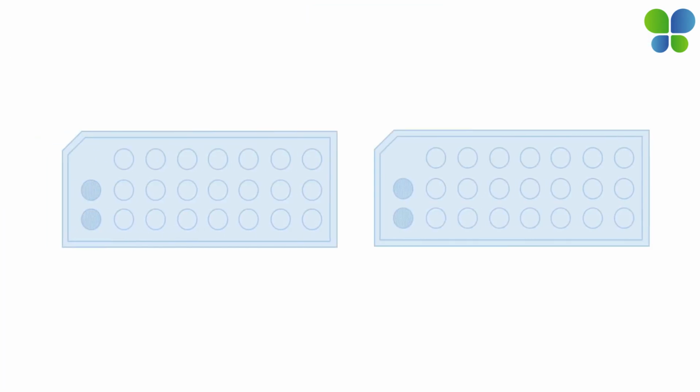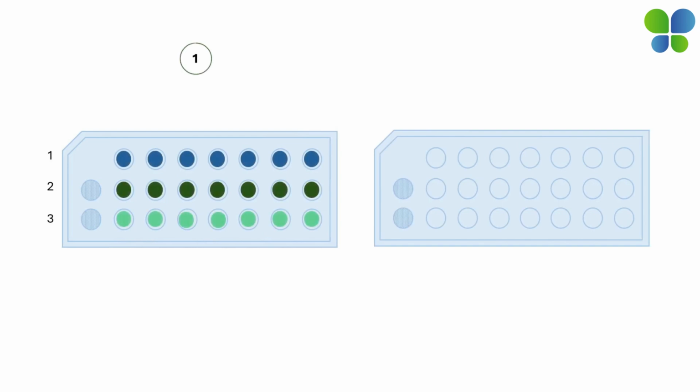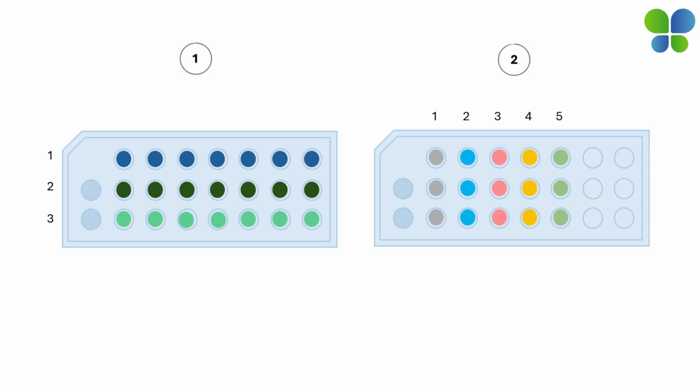Batch-to-batch comparisons are performed throughout the manufacturing phase to monitor the drug substance using the flexible design of experiments that take advantage of 2 different slide cell array setups. The first is a row setup for up to 3 candidates in septuplicate, and the second is a column setup for up to 7 candidates in triplicate. The last evaluation, which takes place during release testing, utilizes the same 2 slide cell array setups to evaluate the drug product before sending it to the final stage of storage.